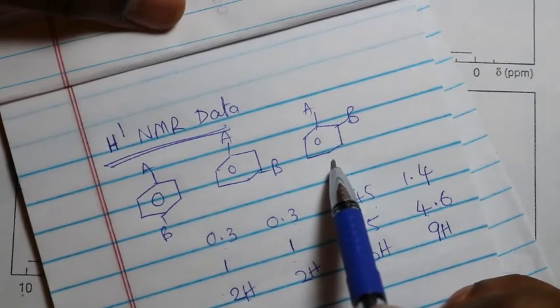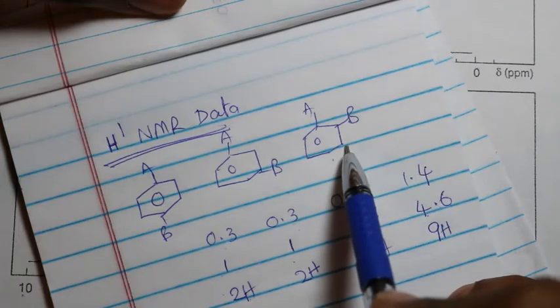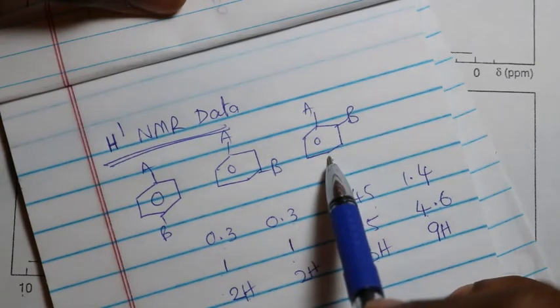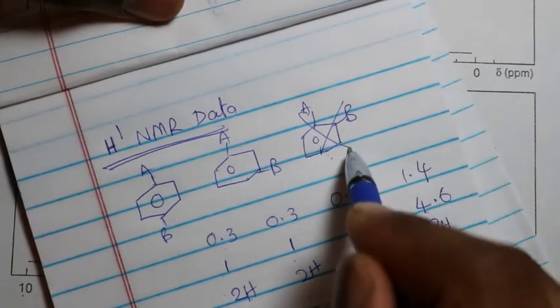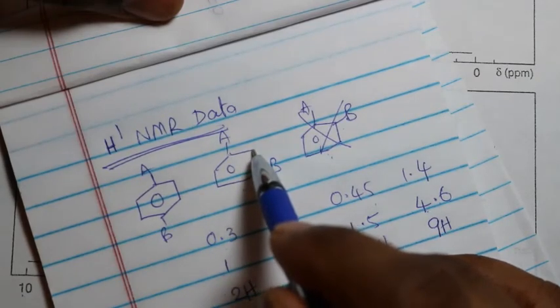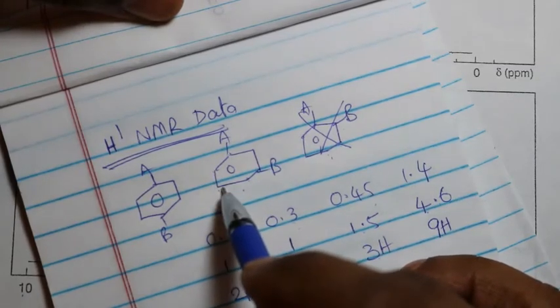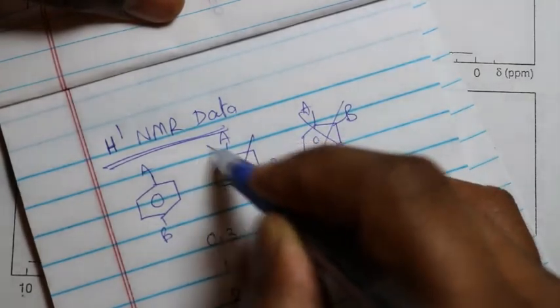Let's see case number 3. In this case, we have 4 aromatic hydrogens, but these 2 hydrogens are chemically different, and these 2 hydrogens are chemically different. So we should see more than 2 peaks in the aromatic region for this case. So we can eliminate this possibility. Now if you see the 1,3 substituted benzene ring, in this case we have 1, 2, 3, 4 chemically different hydrogens. In this case also we should see more than 2 peaks, so we can eliminate this possibility.